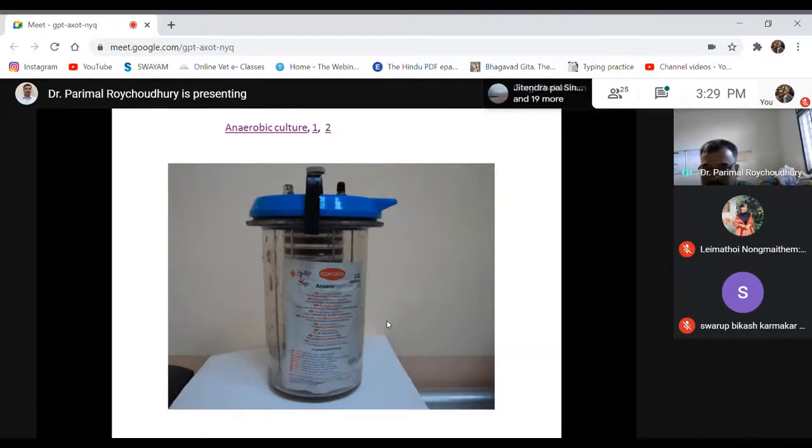In a later part, when we specifically discuss diseases like staphylococcal disease, streptococcal disease, Bacillus anthracis infections, and clostridial infections, one by one we'll again discuss the specific isolation and identification process of those bacteria. So I guess this particular lecture will provide you some information about the isolation process of bacteria that we carry out in our laboratory on a regular basis. Some components you need to do by yourself once normalcy comes.